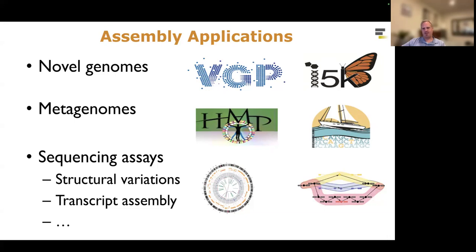If you're looking at genes or pathways, you just need a good genome assembly to be able to do this. So those are characterized by basically looking at one genome in isolation, getting a nice reference genome for it out of the assembler.